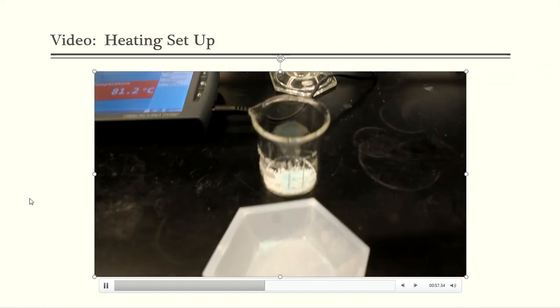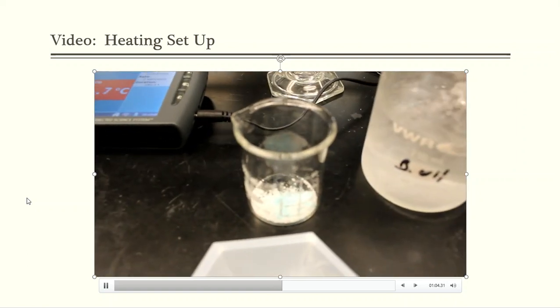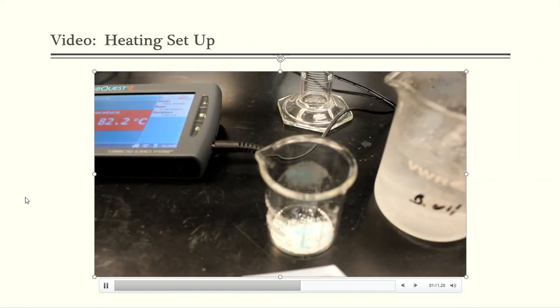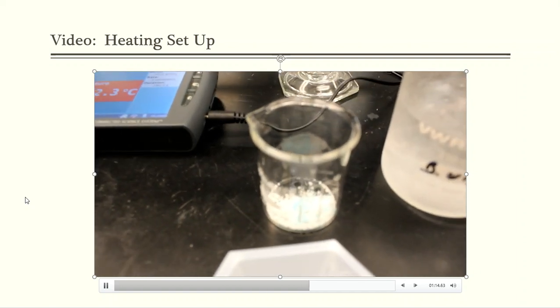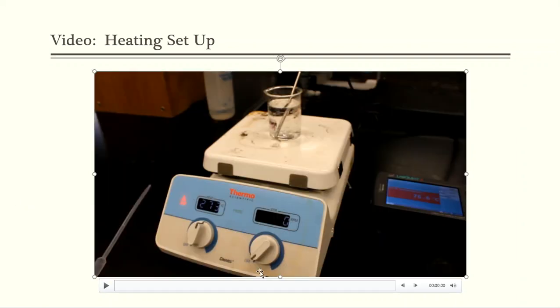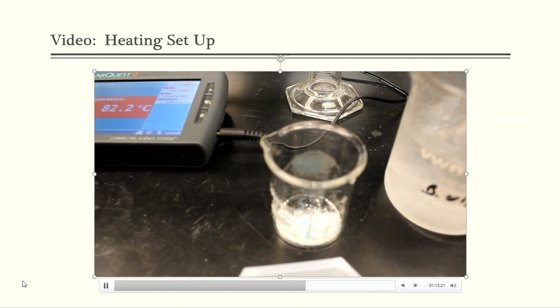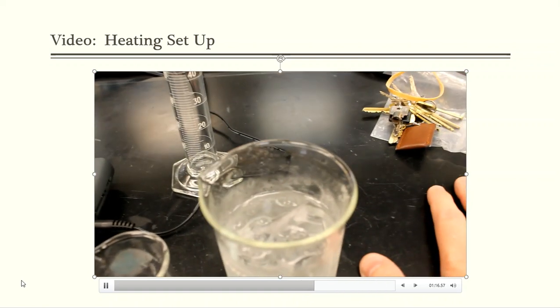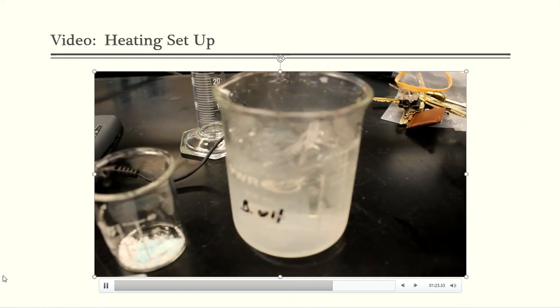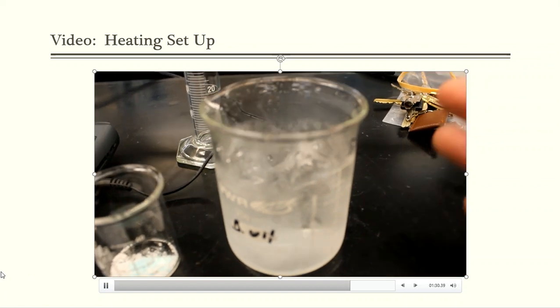When that dissolves all of my solid, I then have an ice bath that is ready to go. So once all of that gets dissolved in the 95 degree water, once I make sure that everything is dissolved the best way possible, I might have to add 1 or 2 milliliters extra, who knows at that point. But I'm going to take that solution and that beaker, and I'm just going to place the beaker here in the ice water. So the ice water will get it cold again, and hopefully my pure benzoic acid is settling to the bottom at this point that I can then filter off, recover, and reclaim.